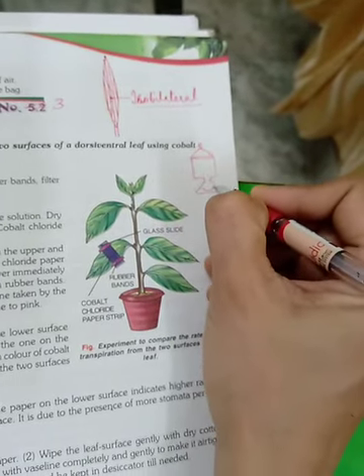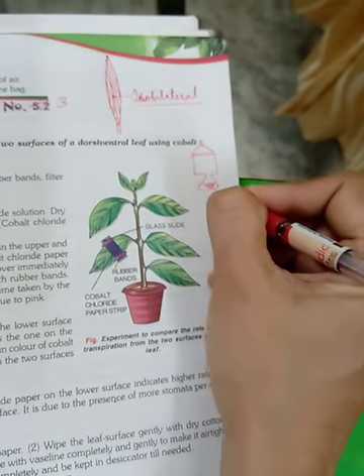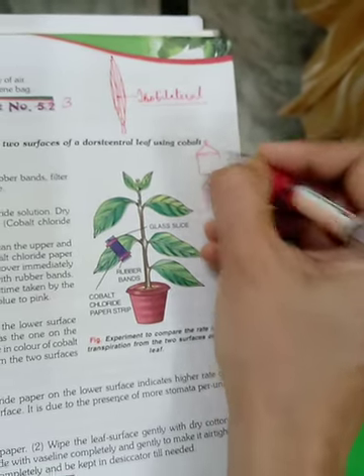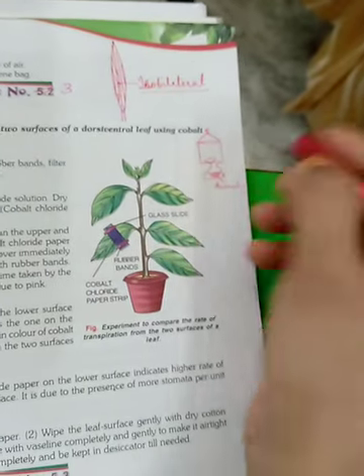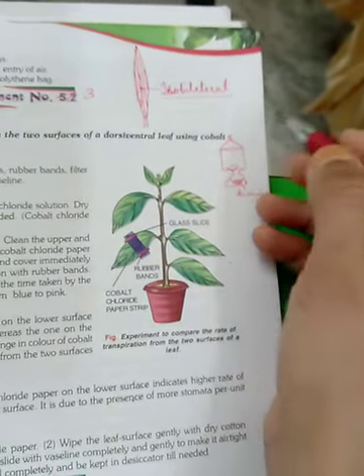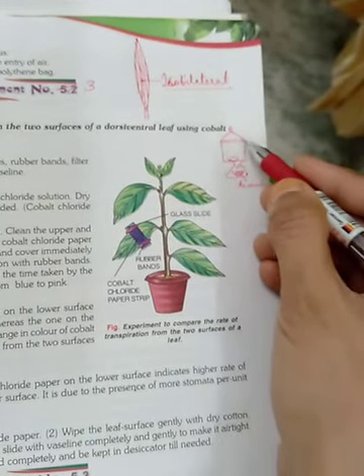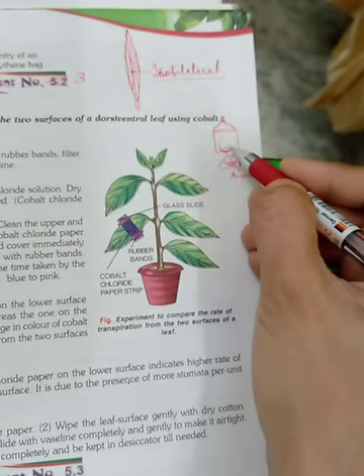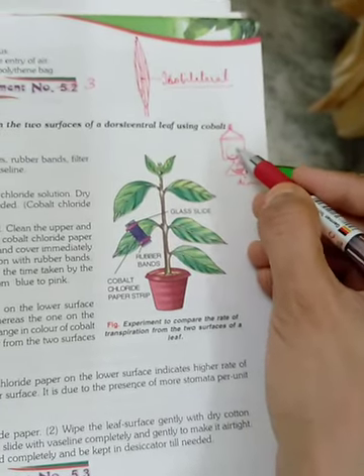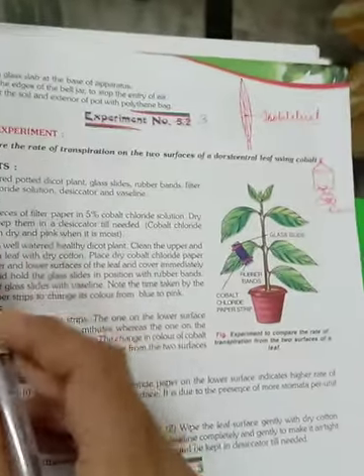There's a desiccating agent that we keep here, and anything that you keep here will be kept totally away from moisture, because this desiccating agent absorbs moisture from the instrument. So anything that you place here for 1 day, 2 days, will be totally in the absence of moisture. So let us see how you proceed.